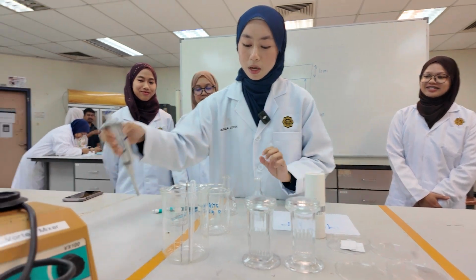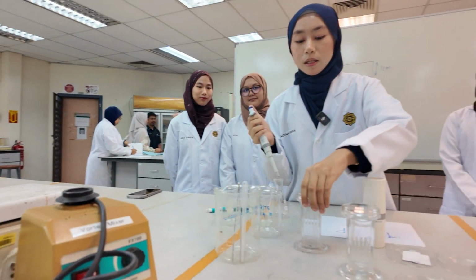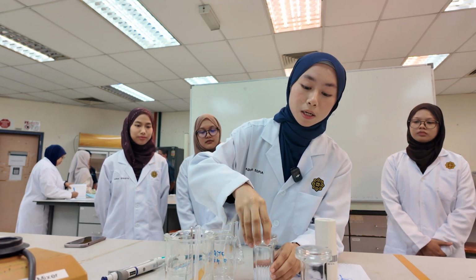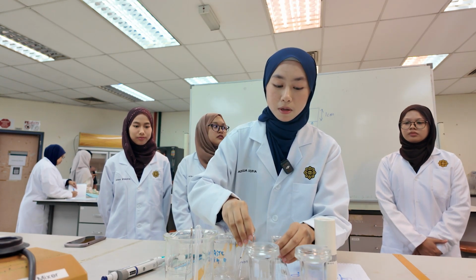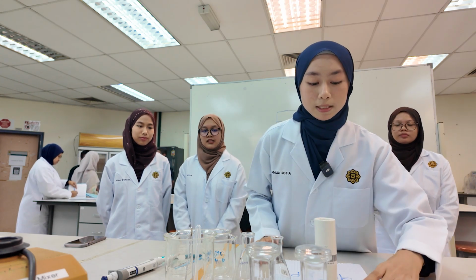Place 5 ml of each developing solvent in the developing chamber using a micropipette. And don't forget to close the lid of the developing chamber to avoid it from evaporating. Okay, let's move on to the TLC plates.